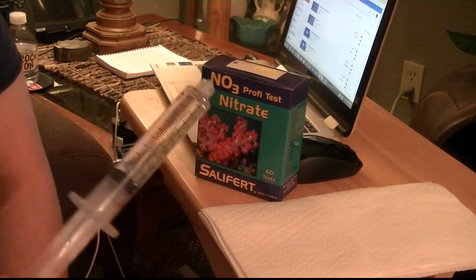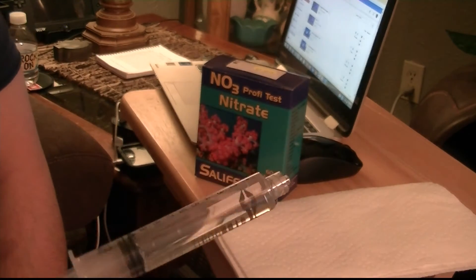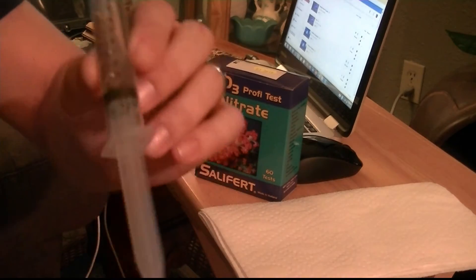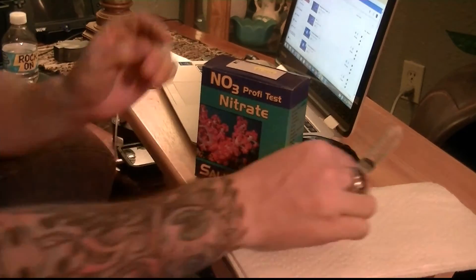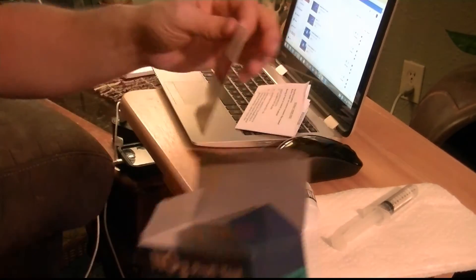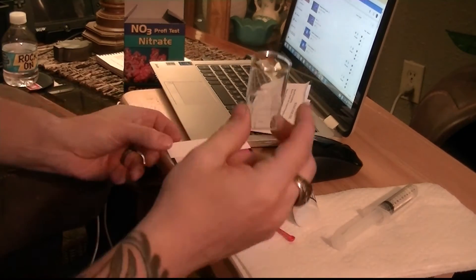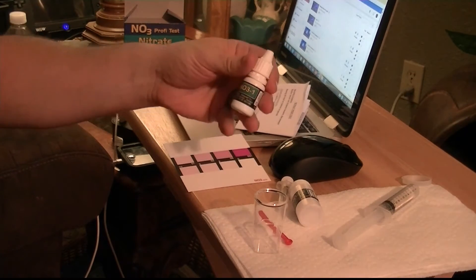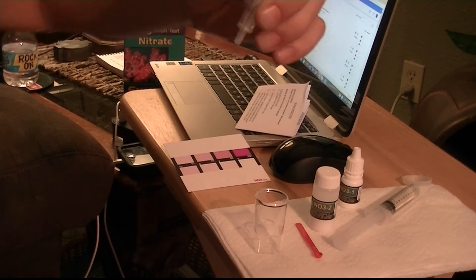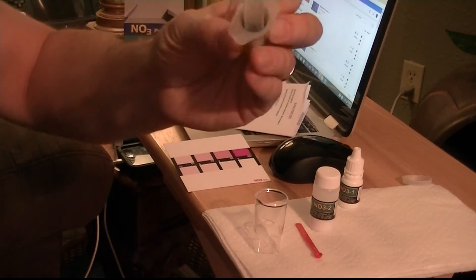Alright guys, here's some of the stuff that I use. This is a syringe that I buy at the farm store, just a plastic syringe. I use this same one for drawing water out of my tank to use in all my test kits. I feel like if I use this same one over and over again to pull out the sample, I'm more accurate with it. So let's open the Salifert kit and see what's inside. I have instructions and several pieces here — you've got the card with the different colors on it, the test vial, cap, a solution, one powder, and then it comes with a syringe. I always use my own and I feel like it gives me better accuracy.